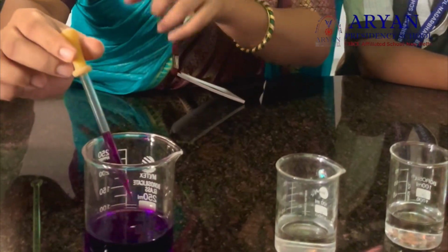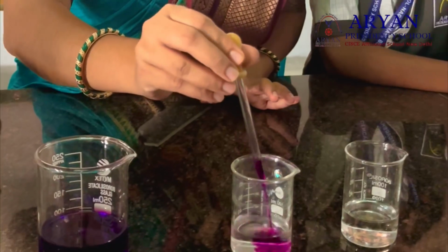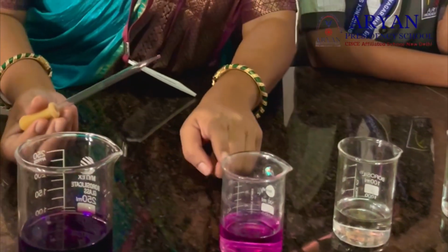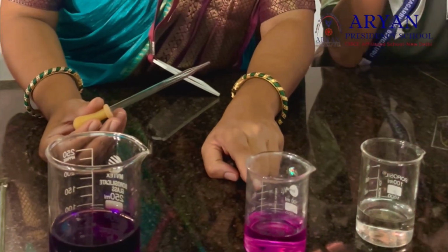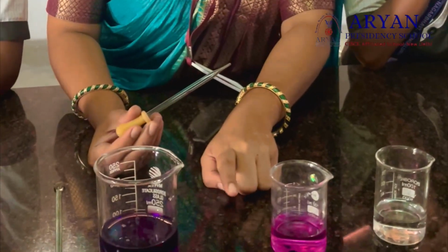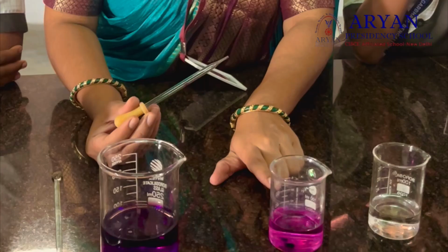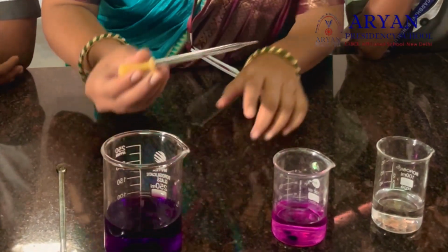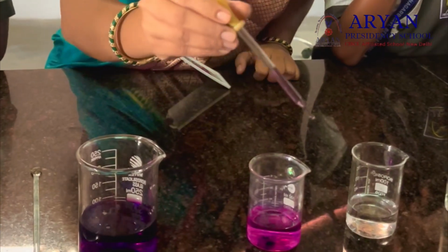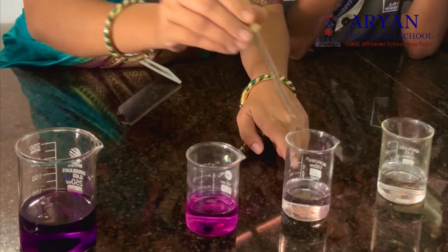Now I'm taking 10 ml from beaker A and transferring this 10 ml to beaker B. Now you understood? What is the color of beaker B now? Is it the same color? No, not exactly the same, but it is a lighter color, isn't it? It's lighter than beaker A. Now I'll take 10 ml from beaker B and transfer the same to beaker C. The process I am repeating. Understood?